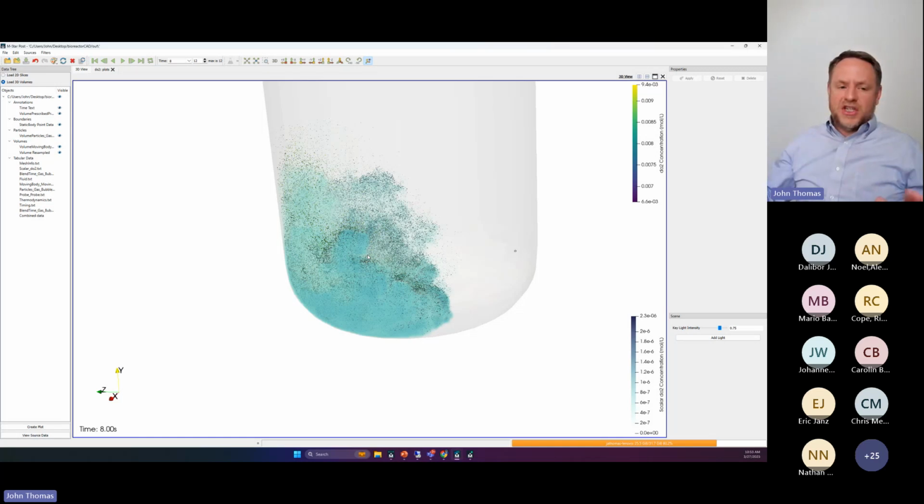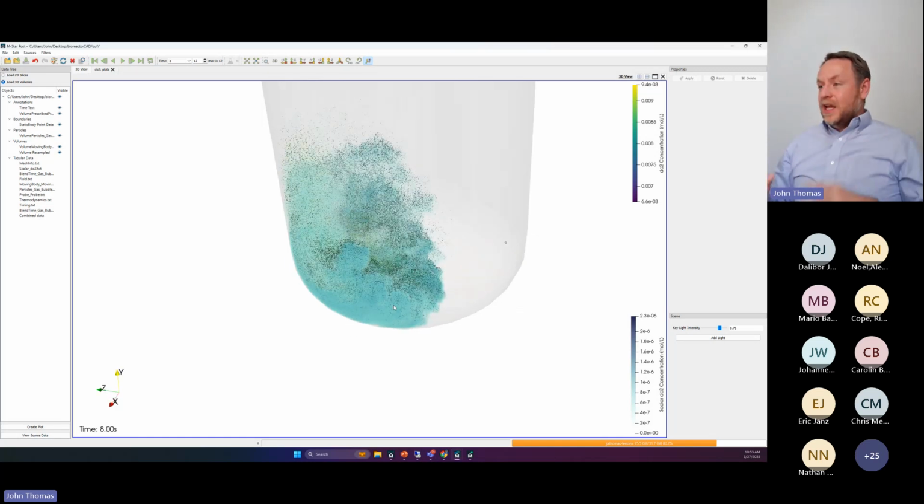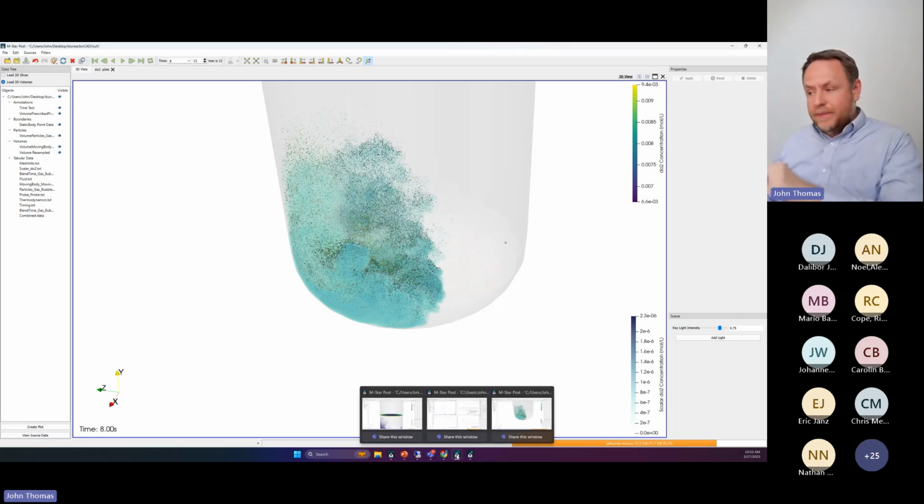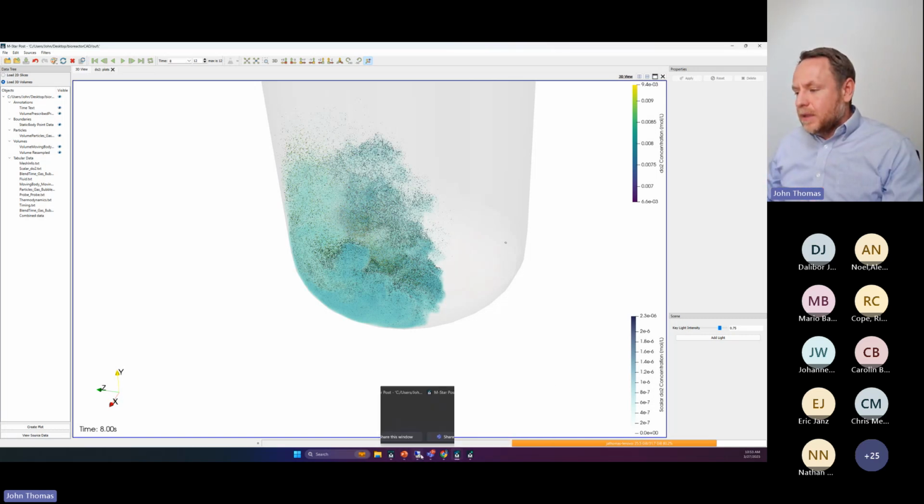And it totally changes how you simulate, as opposed to going into a simulation white-knuckled and hoping it runs after a week. When you're iterating like this, dynamically building, getting feedback, seeing and changing, it changes how you simulate flat out. Now, there's one more bit of physics I want to add that I'm going to have to pull out of my Easy Bake Oven, but I'll illustrate how I'm adding it here.